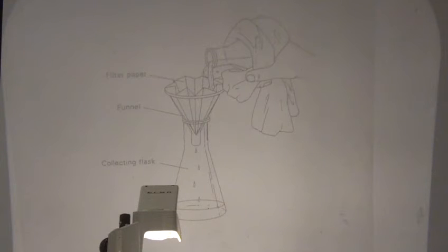After your 2 extractions, if you have questions about what trimeristin is being left behind, make sure you talk to your lab prof and see if you need to do more extractions. It's easier to take care of it now than at the end of lab find out you don't have very much stuff and then we've got to go through the process again, all right?